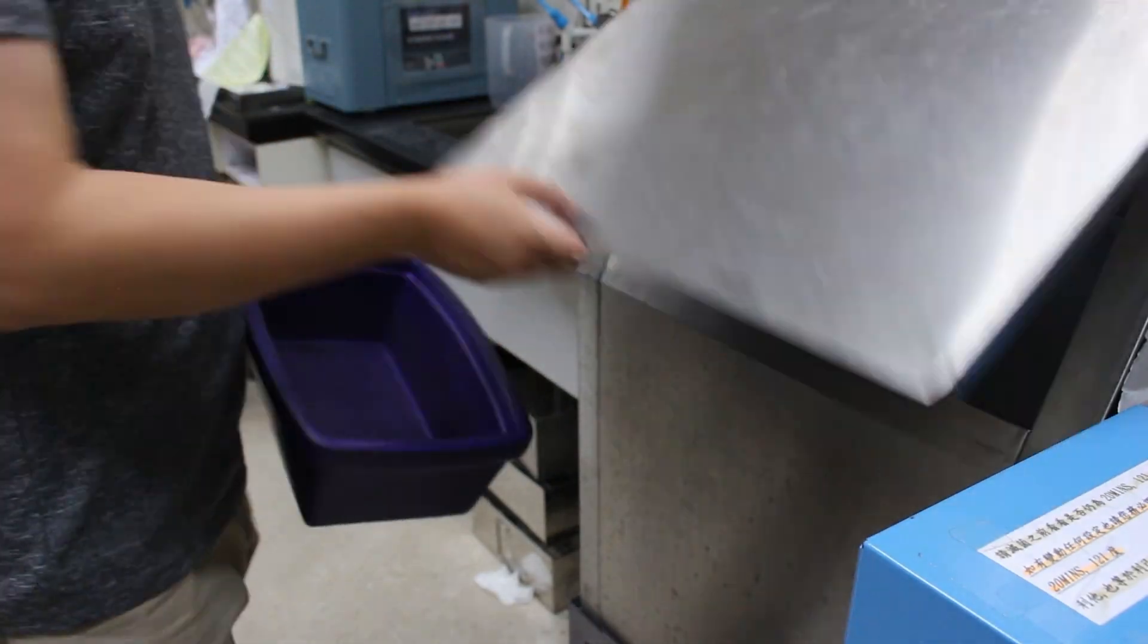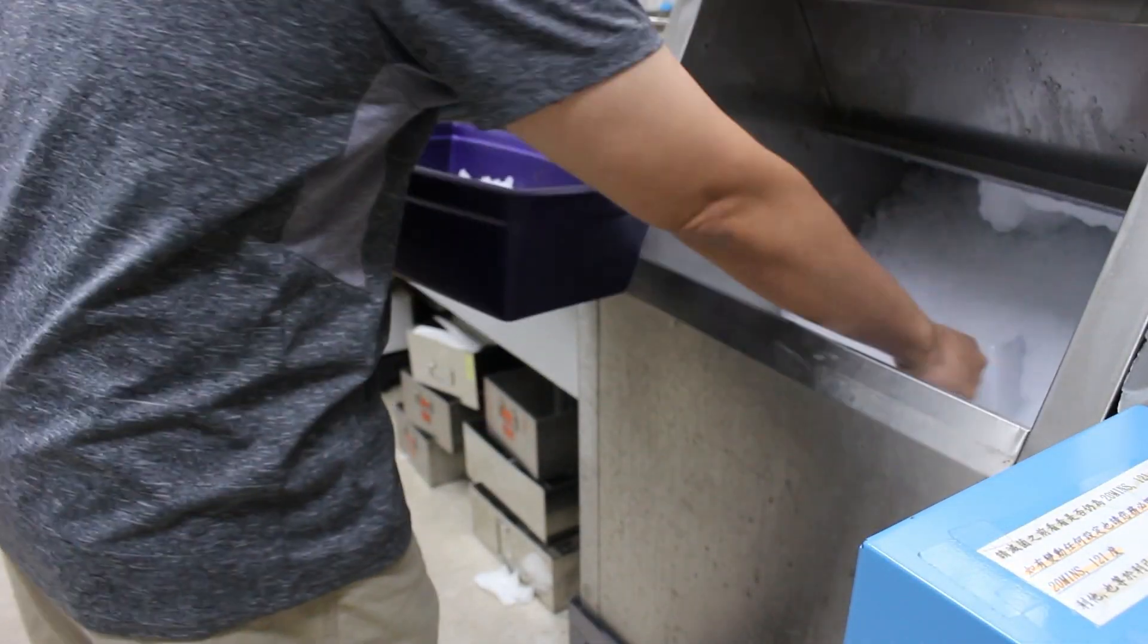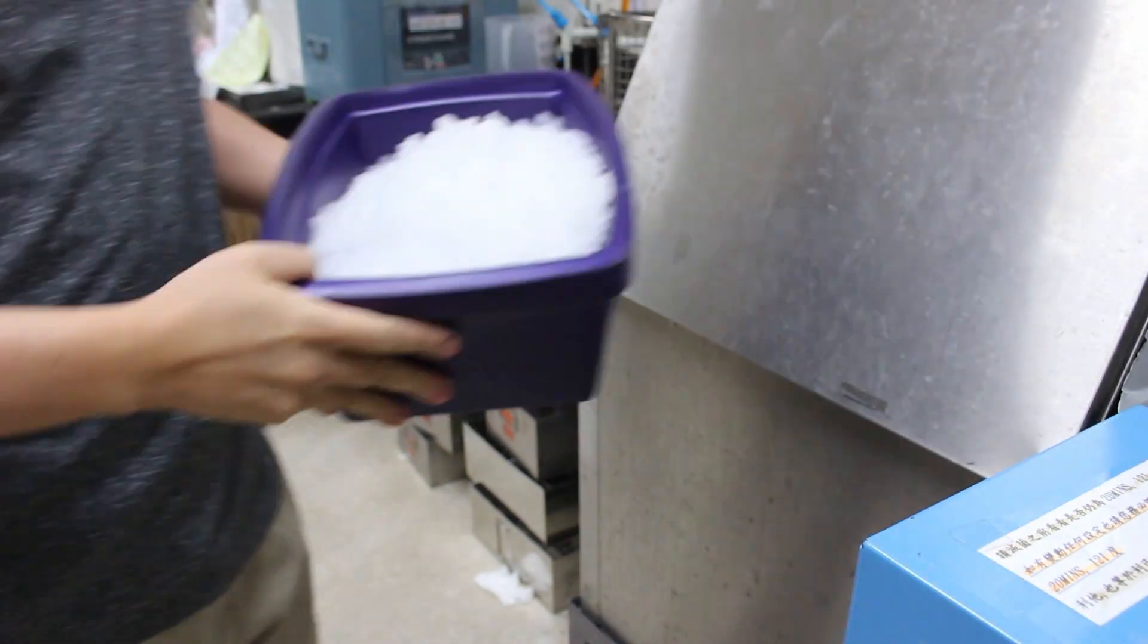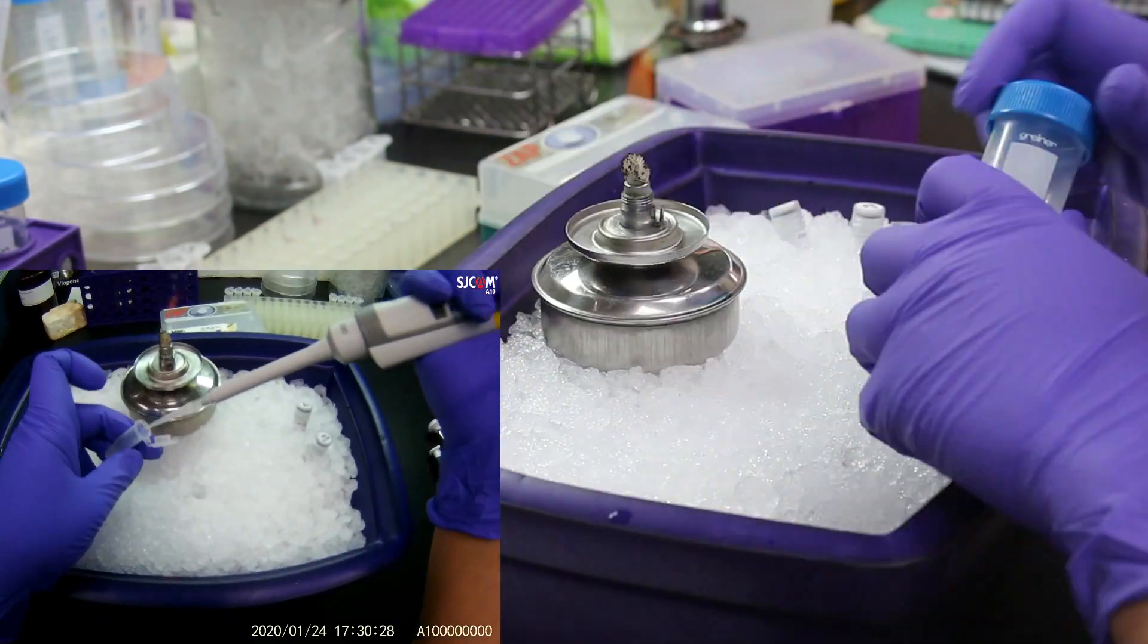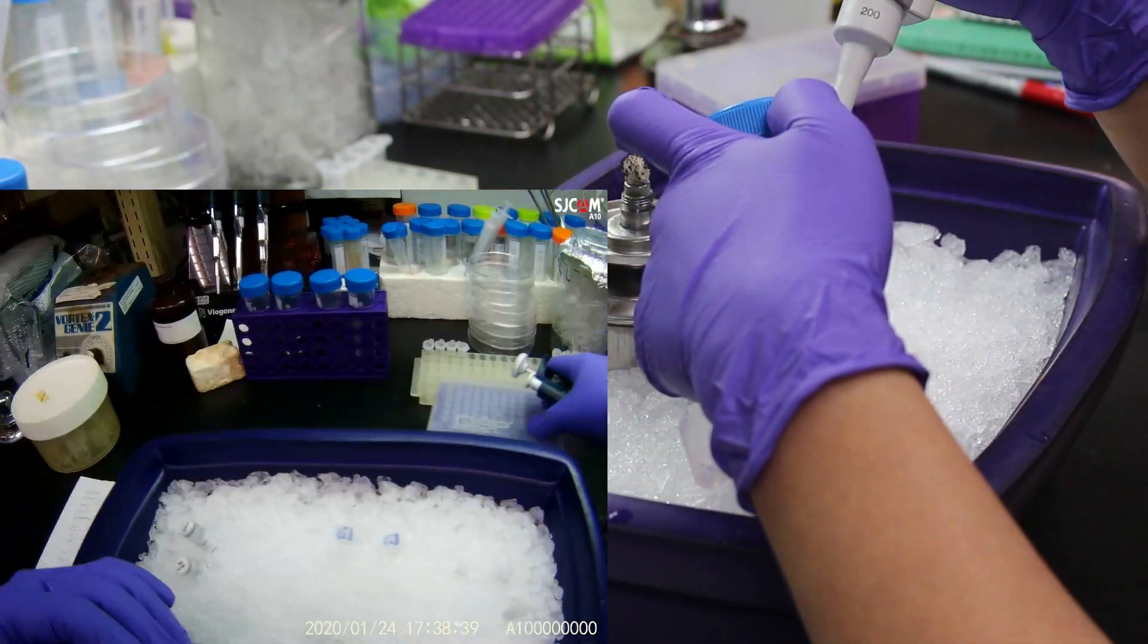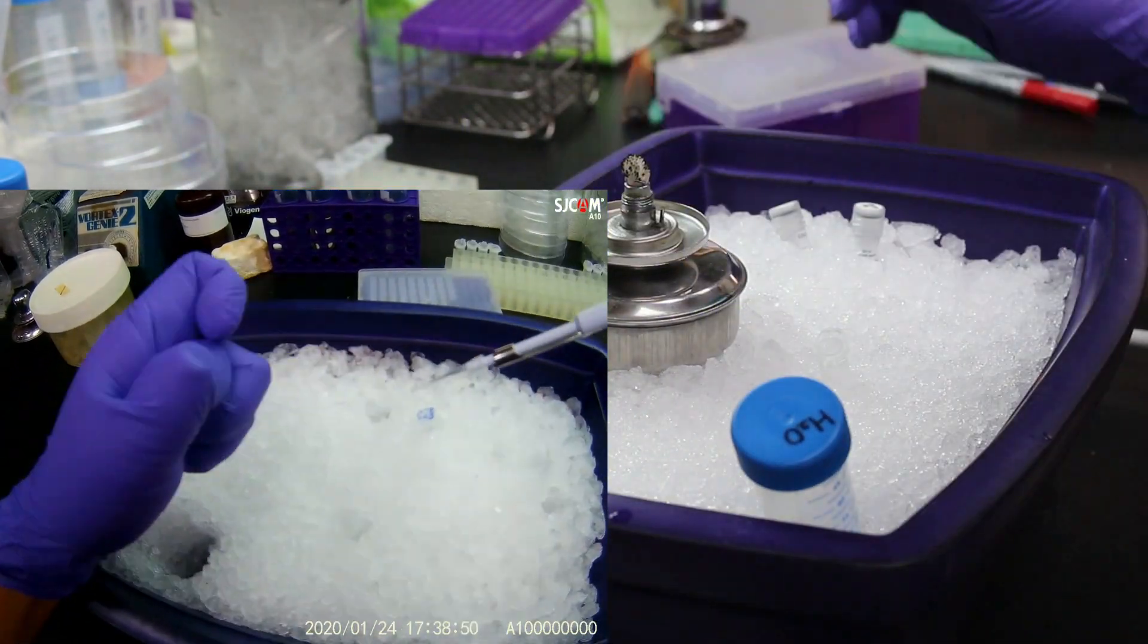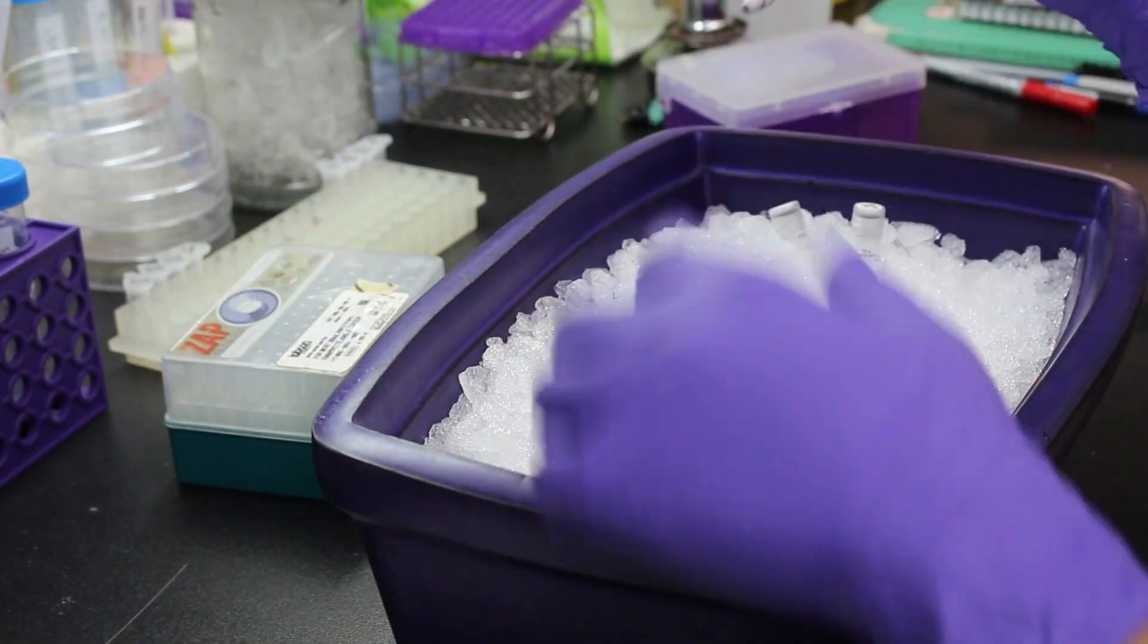Now, starting with scattering ice into ice bucket, because we want to keep the process in low temperature. Next, mix all the reagent in a centrifuge tube. I prefer adding water first and enzyme the last. It will be easier to mix evenly.